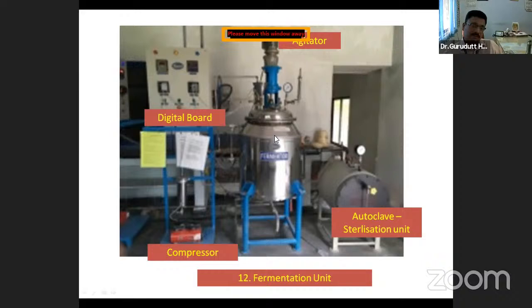Here it is 1 week, and then mixing with the talc powder at 1:3 ratio will take 1 week. So that means in a normal 3 weeks time, in one cycle, as we call it, we can produce 300 kilos of Trichoderma harzianum by this kind of unit.